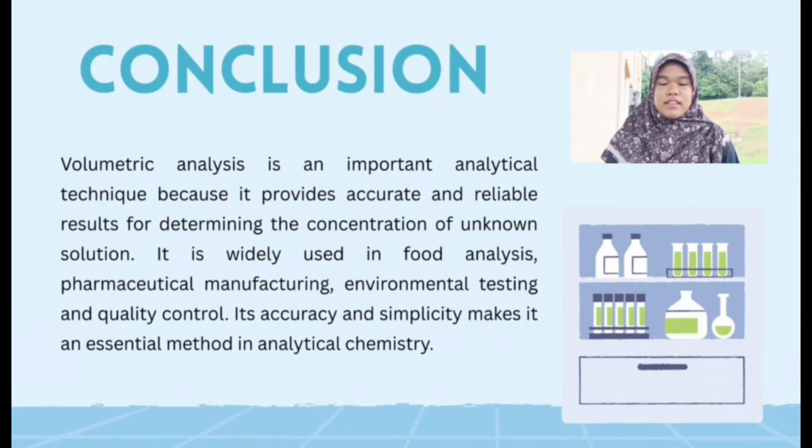In conclusion, volumetric analysis is an important analytical technique because it provides accurate and reliable results for determining the concentration of an unknown solution. It is widely used in food analysis, pharmaceutical manufacturing, environmental testing and quality control. Its accuracy and simplicity make it an essential method in analytical chemistry.